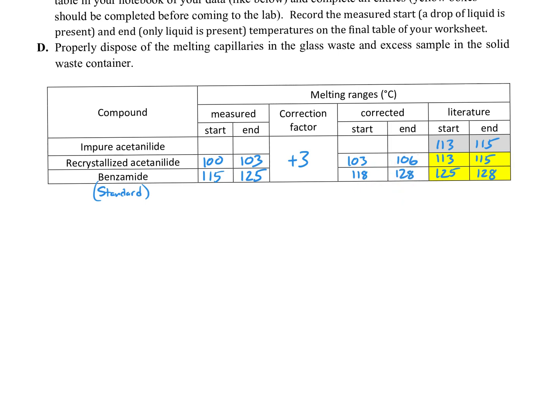In this case, something happened. Maybe we heated the samples too fast, because sometimes you can have too high of a ramp rate on your Digimelt, and in that case, the thermometer might not be reading exactly what the sample is experiencing inside the heat block at any one time, so that might give you some inaccurate numbers, or something else could have happened that just causes us to disbelieve this data here. So in this case, we would want to start over.